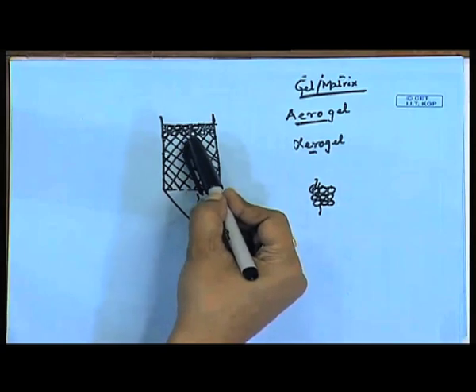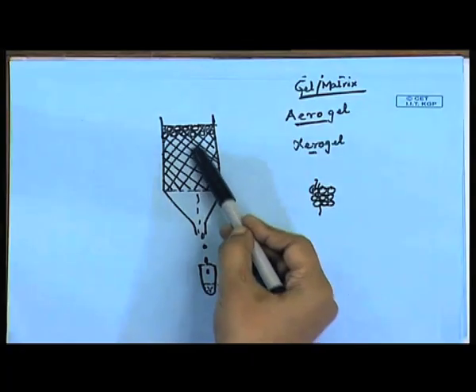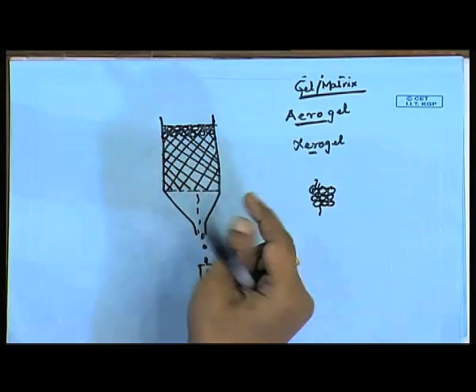So, we can get the approximate molecular weight. Now, if someone questions that when this separation is taking place, sometimes gravitational force may also play a significant role. So, what to do in that case?